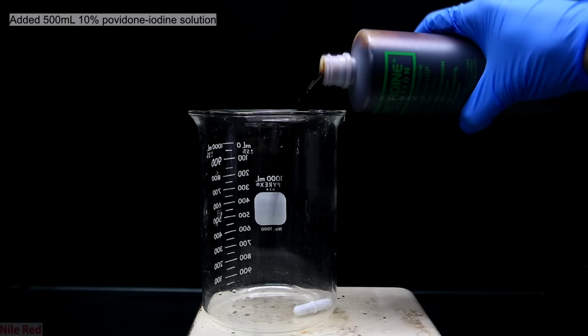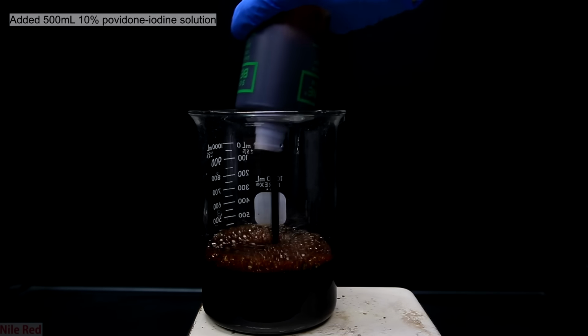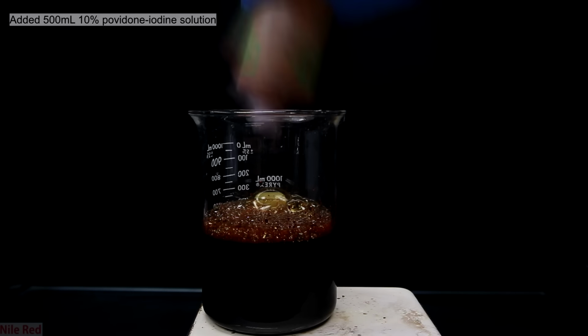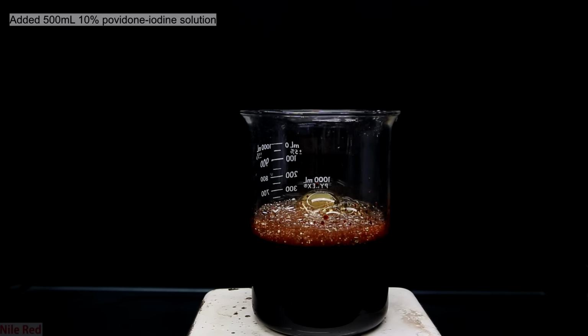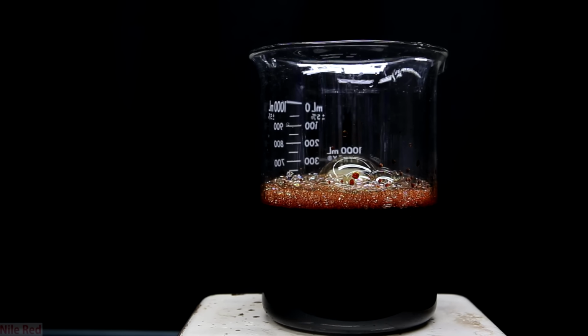To a 1 liter beaker, I poured in the 500 milliliters of my 10% iodine-povidone solution. The solution is extremely dark red, and as you pour it, a little bit of bubbling occurs. Once everything's been added, I use my magnetic stirrer to start mixing it. A magnetic stirrer is not mandatory, it just makes things easier. If you don't have one, you can also stir it with something like a glass rod.